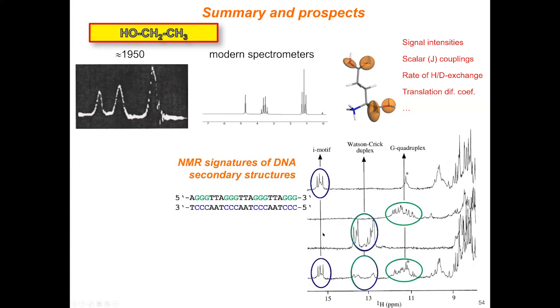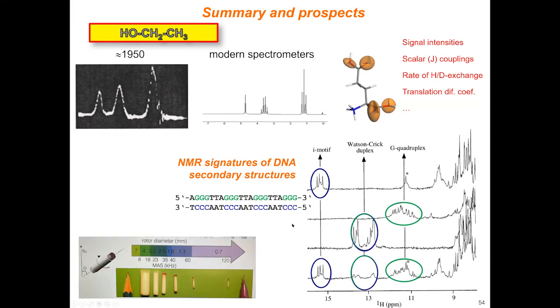So NMR is a wonderful thing to screen, to get high resolution insight. And obviously you have a dedicated lecture. You do magic angle spinning, I think you will understand now, and rotor size, and Professor Mali will explain why you would sometimes spin at a few kilohertz, why you would go above 100 kilohertz. And with this, I'll finish here. I think it's almost exact time.